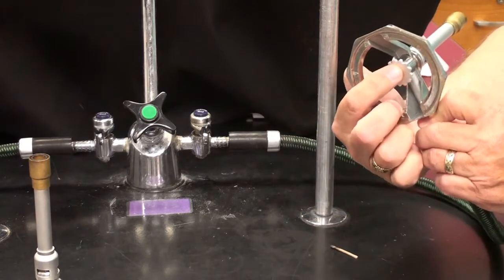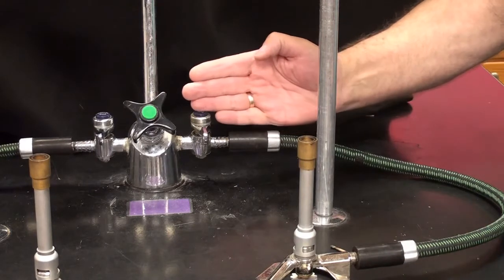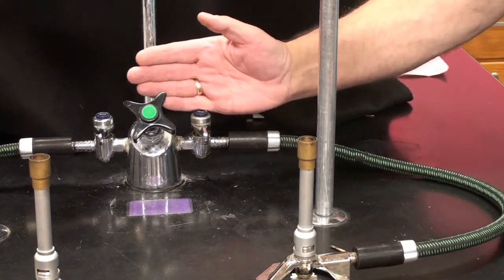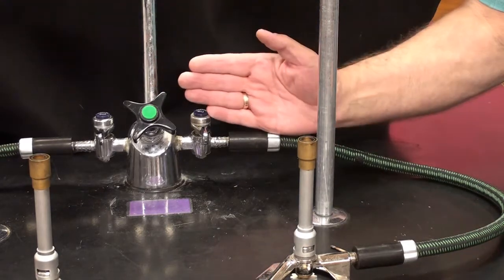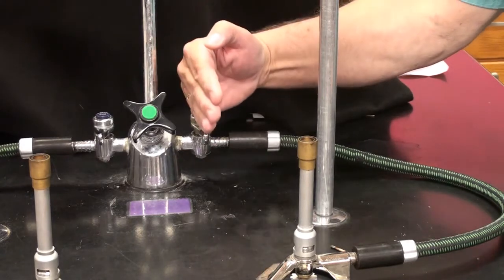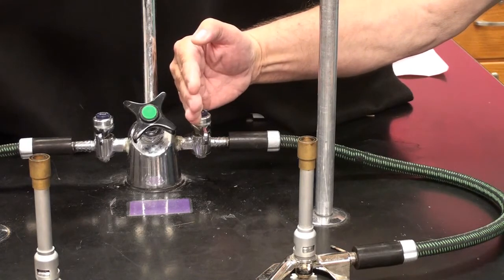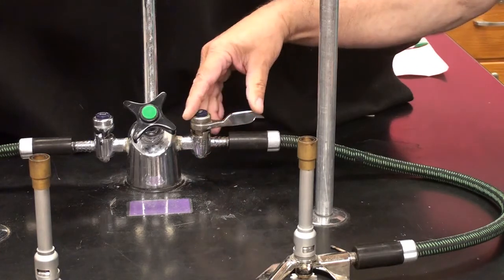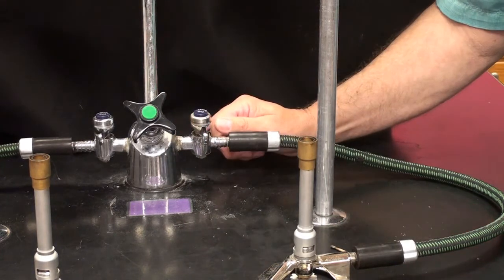So one of the ways that you can let gas in is right here. The other way, the easier way in many ways, is the one right over here at the tabletop. So we have a hose out here that gas can flow through. If this handle is perpendicular to the direction of the hose, that means the gas is cut off. If this handle is going the same way as the hose, you might even be able to hear that. That means the gas is on.